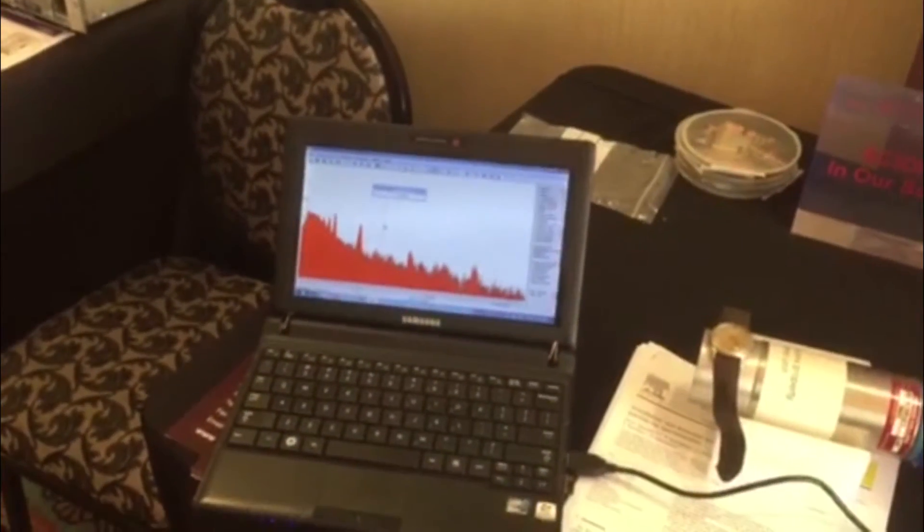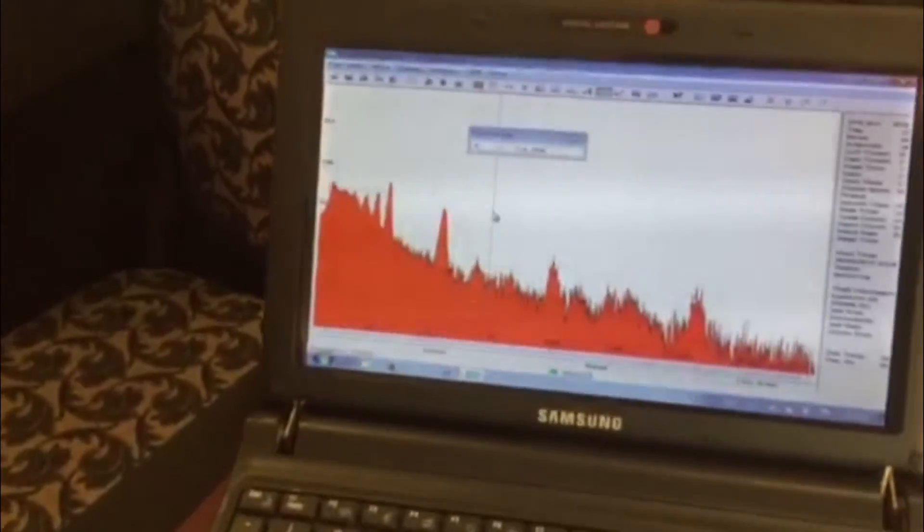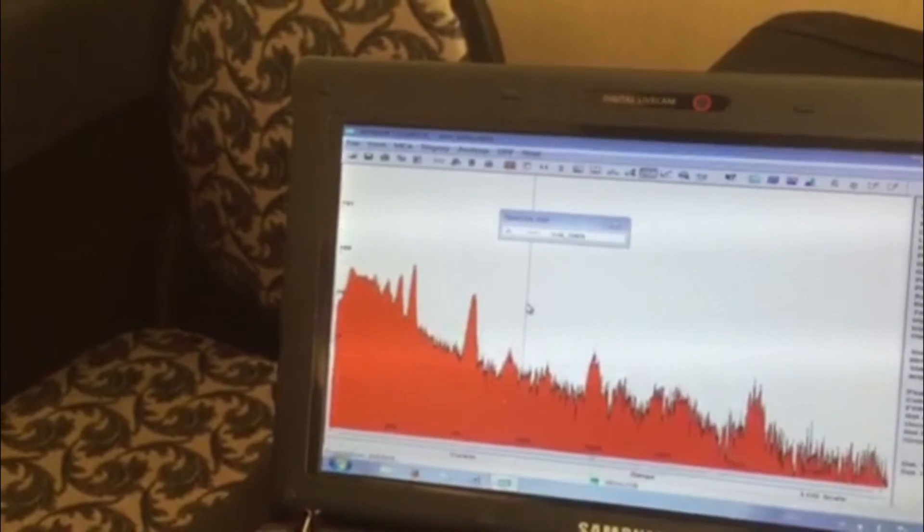Here we have a cerium bromide spectroscopy system — super portable. Here we see the 4% resolution.